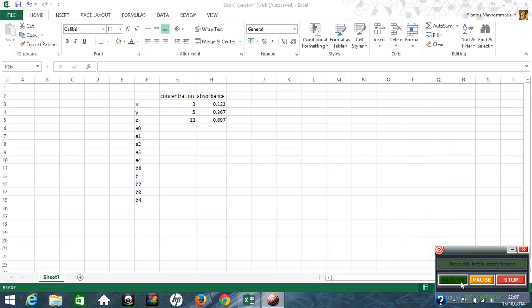paper. However, I have received a lot of requests for assistance from people who want to do it on Excel, although they don't know how to do it on Excel. So anyway, it doesn't make much sense to me, but instead of replying to every single one of you individually, I prefer to make a very short video to show you very briefly and very quickly how to do it. If you don't get it, then you may have to focus on using graph paper.